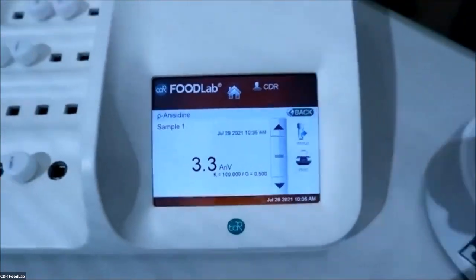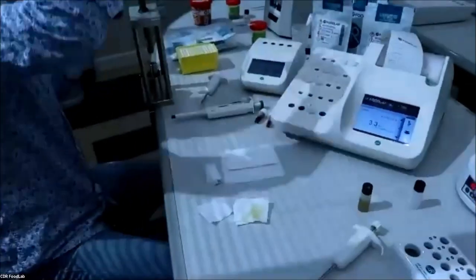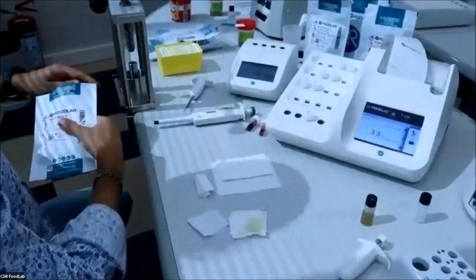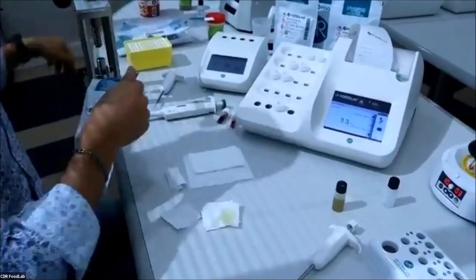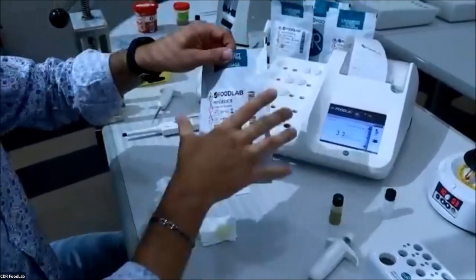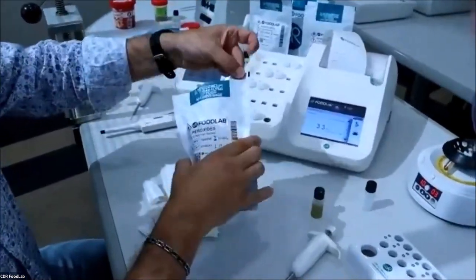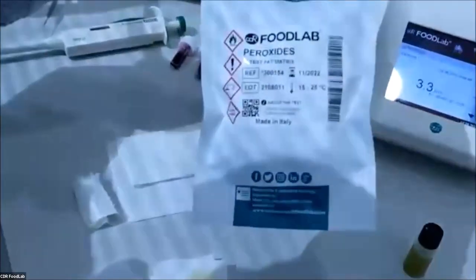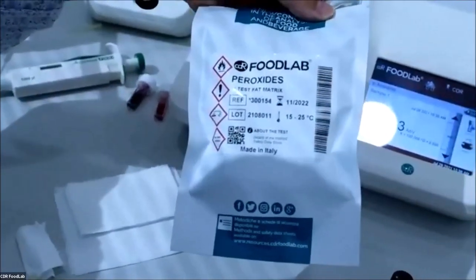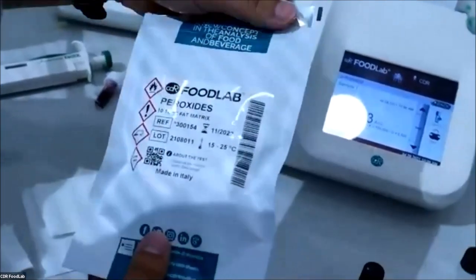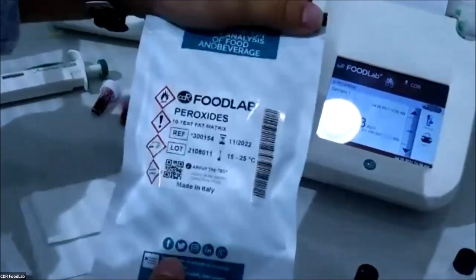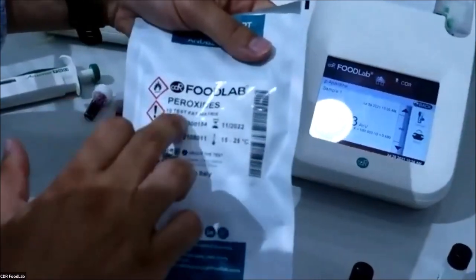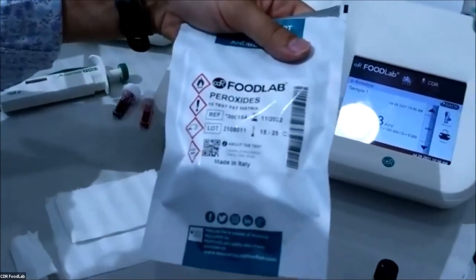Here are the kits. For example, the peroxide kit — you have on the label the lot, the batch, storage temperature, and all the information. Inside you have 10 cuvettes, 10 profiled cuvettes, so you have everything you need to run 10 tests of peroxide. The kits always come in this shape. This is the kit for free fatty acids, which looks the same.